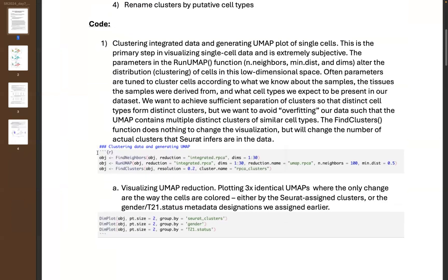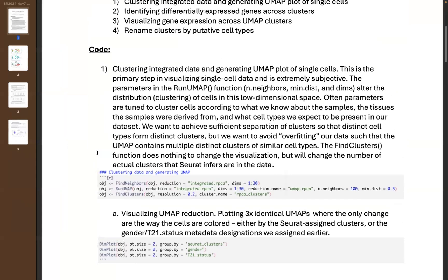So the first thing we do is take our integrated object from yesterday and we're going to cluster — generate clusters from these single cells. The first step in this process is to run the FindNeighbors function, which happens before we can do our actual UMAP reduction.